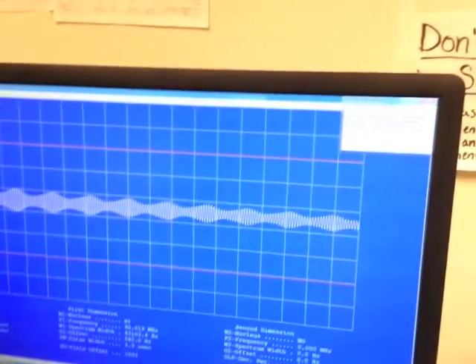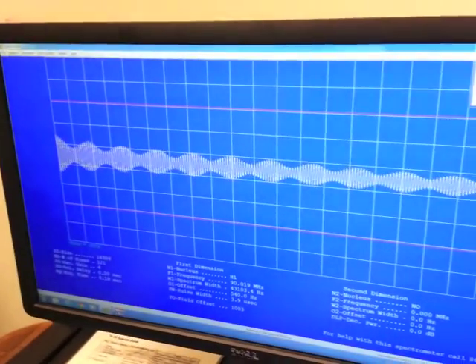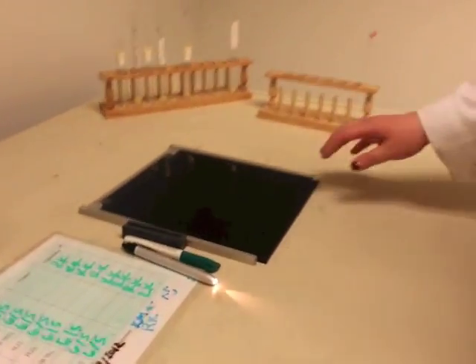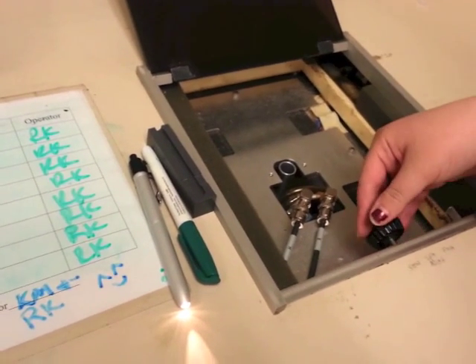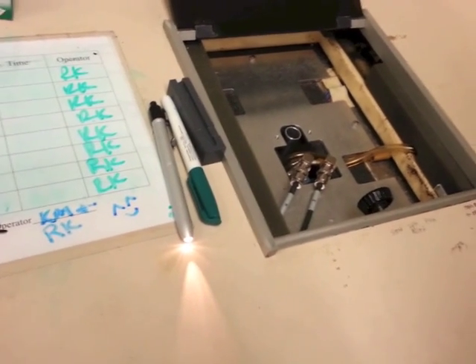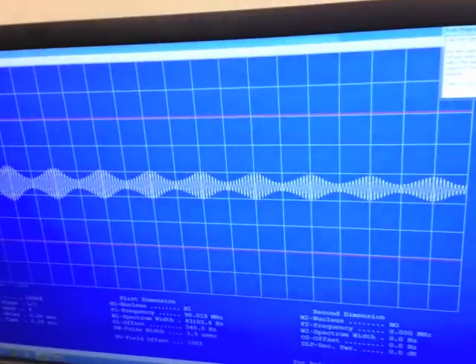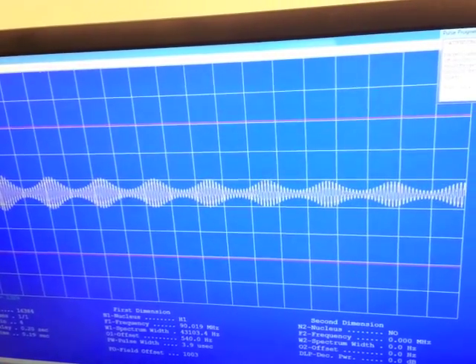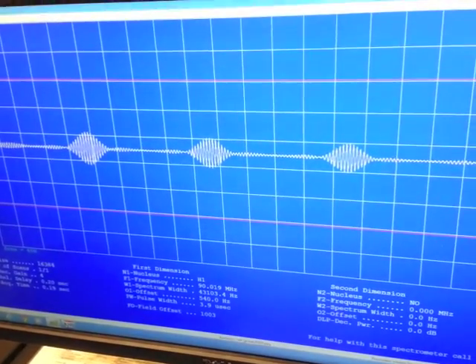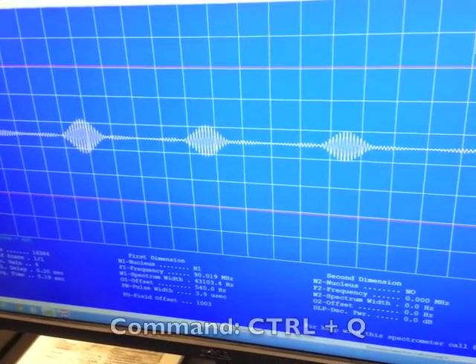After a few minutes, a box will pop up prompting you to adjust the spin rate so there are five spaces between each of the peaks. Come back over to the machine and adjust the knob until there are five spaces. Turning it one way is slower, meaning more spaces between each peak; the other way is faster, meaning fewer spaces. Once there are five boxes between each peak and the peaks are not jumping around, come back to the computer and press Ctrl-Q.